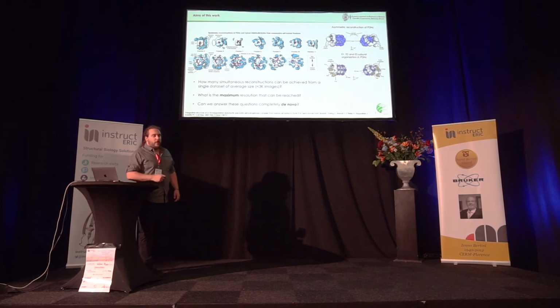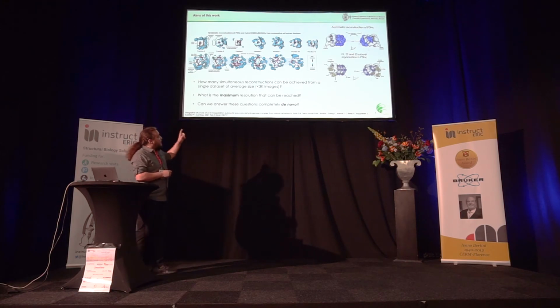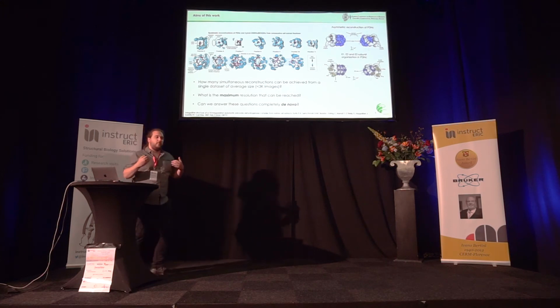In a previous work by our lab, we managed to characterize two different complexes across cellular extract fractions, but with mass spectrometry and negative stain EM and not cryo. Additionally, in previous works, we could gain deeper structural insights for a single complex at a time. So, with this work, we aim to go for more.